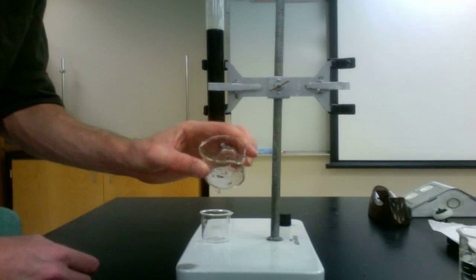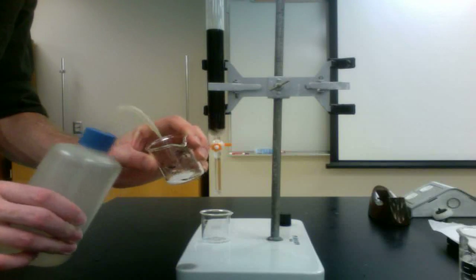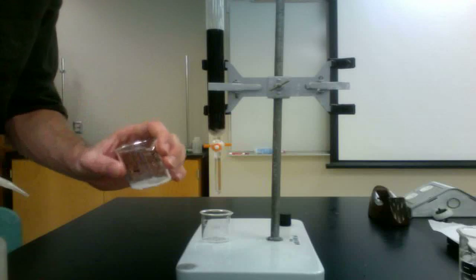When the column is ready, the salt sample can be added. The ion exchange process is done most rapidly when the sample solution is very small. Therefore, you should try to dissolve your salt in the smallest volume of water possible.